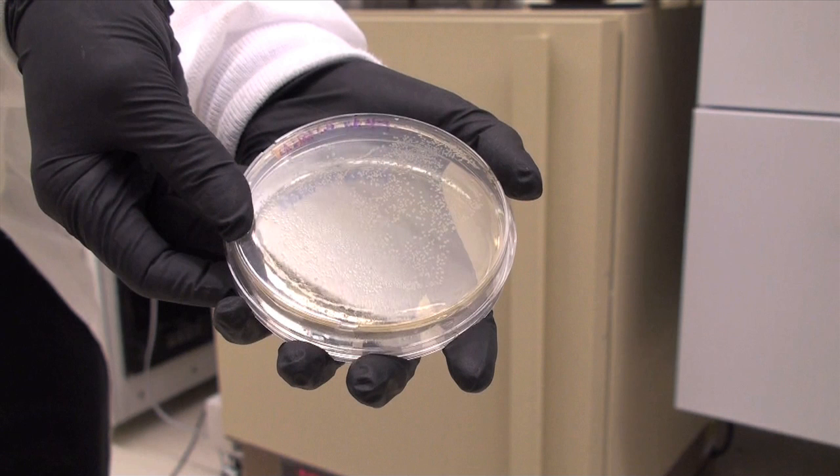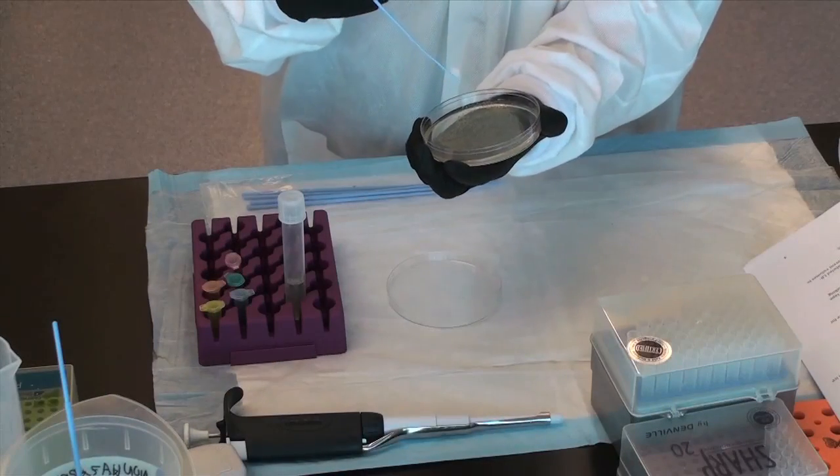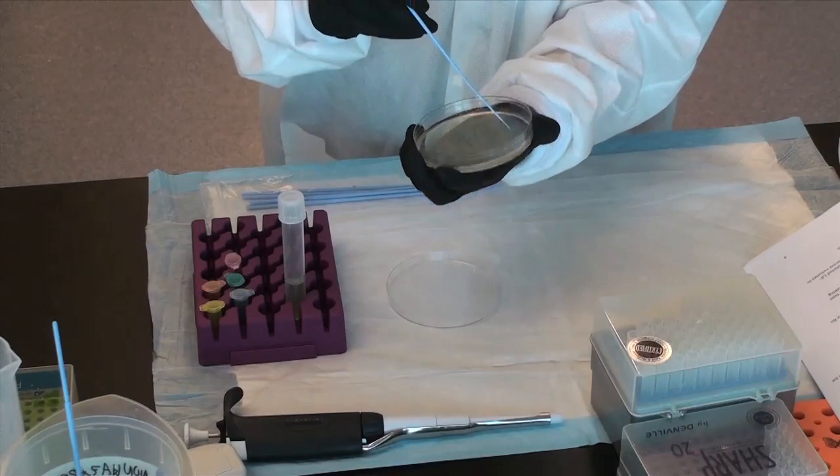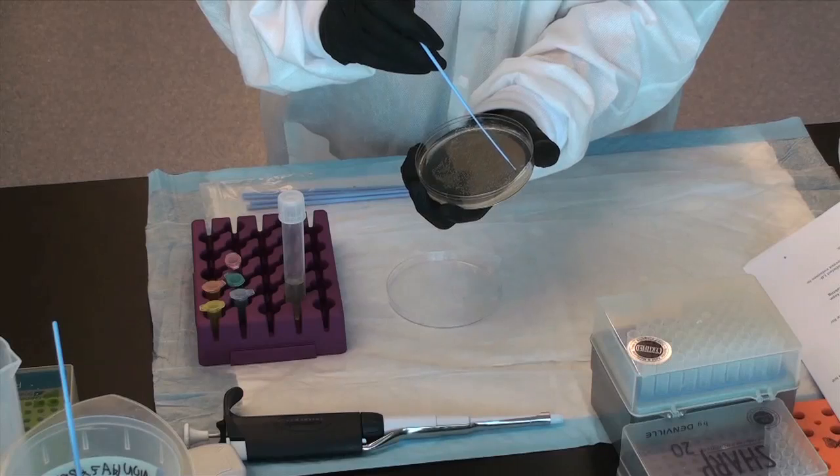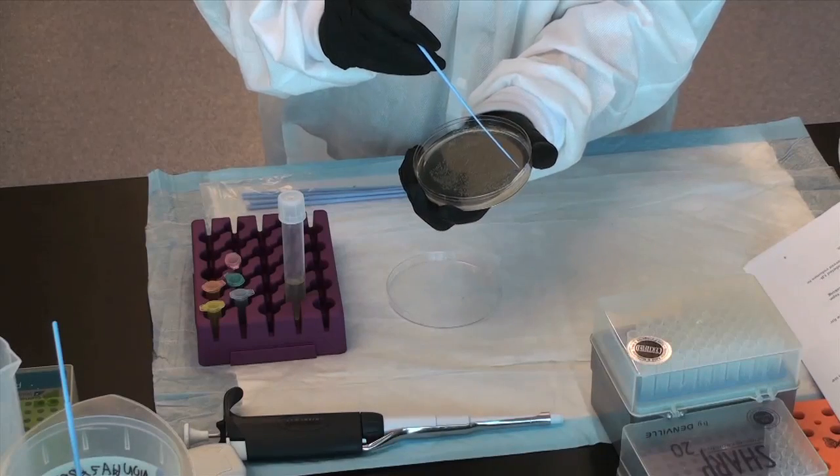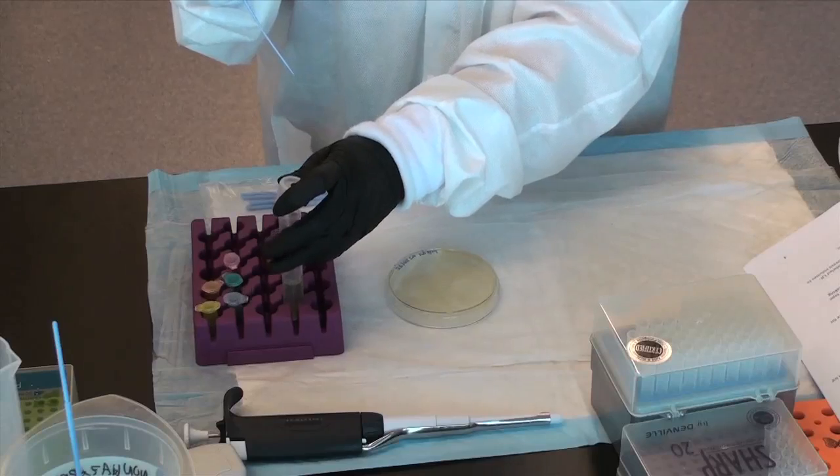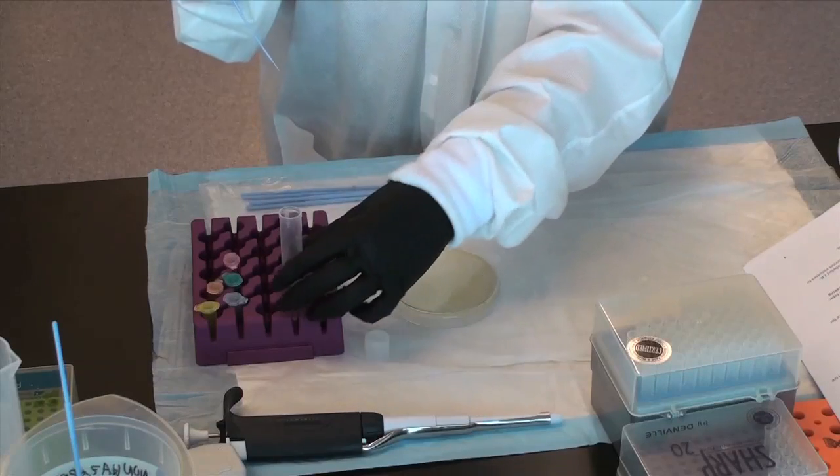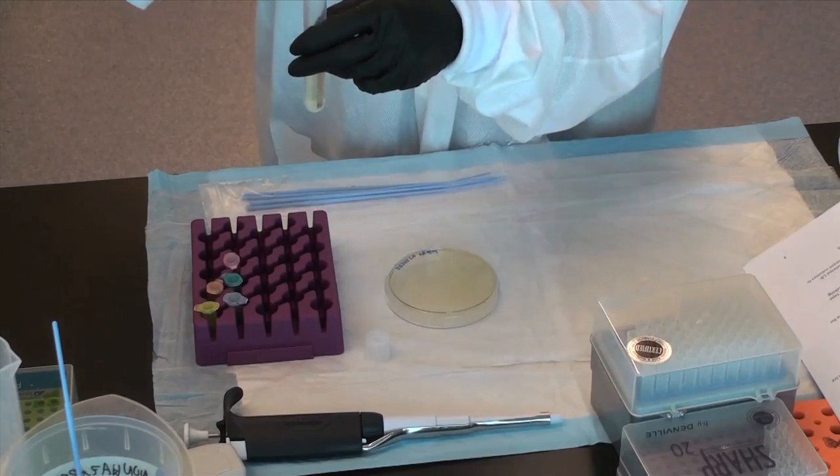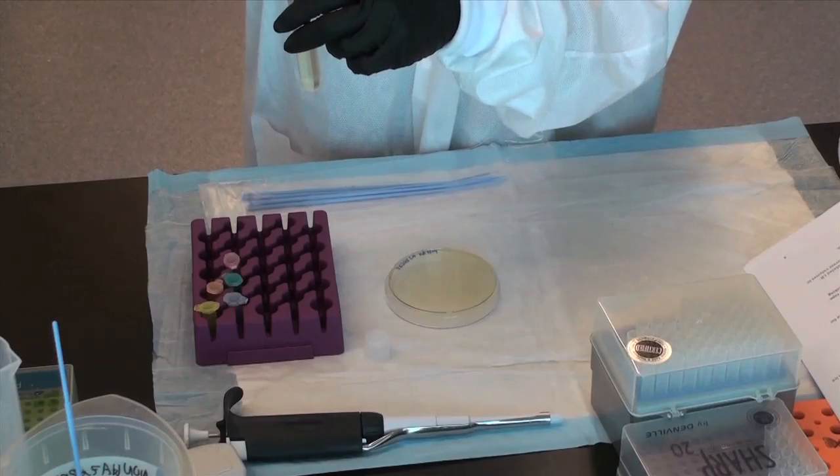Step 16: Observe transformed bacterial growth on selective LB plus ampicillin plates. Step 17: Using a sterile inoculating loop, pick one transformed colony and inoculate 5 milliliters of LB ampicillin broth and place it in the incubator as a starter culture. Incubate for approximately 8 hours at 37 degrees Celsius with vigorous shaking.